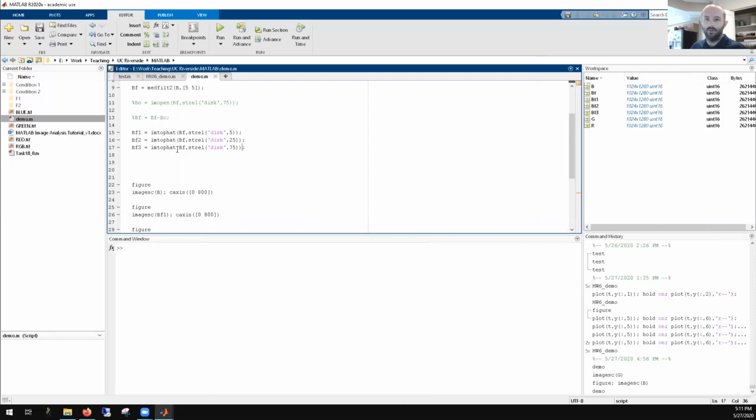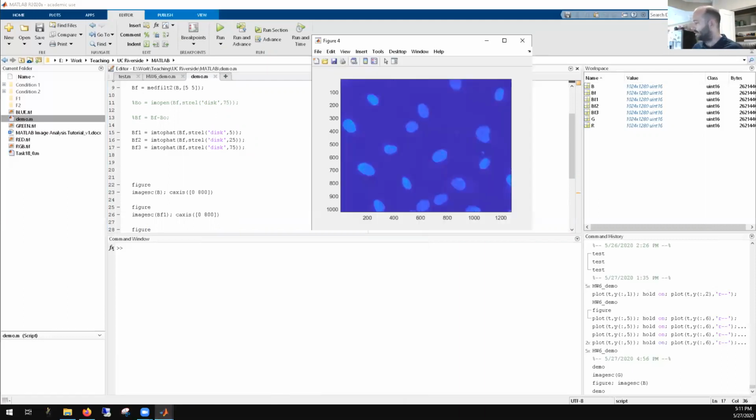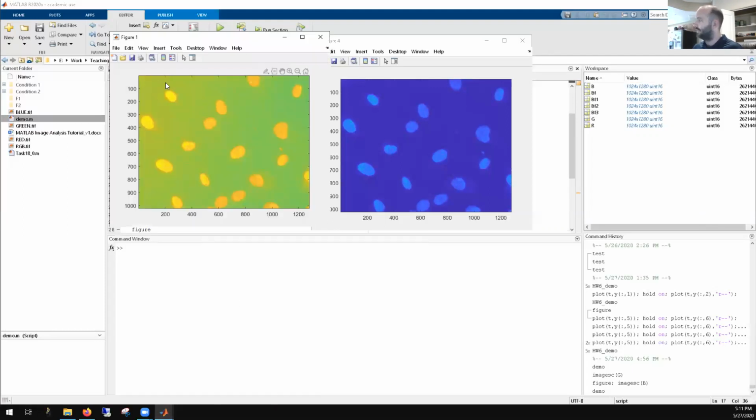If the feature is larger than the ball, then we subtract the feature out, because the ball is just going to follow that feature. So imagine we have this 150 pixel ball. This gentle slope in the background is on the order of hundreds of pixels. So we're going to subtract this large scale feature, this sloping illumination in the background, with our rolling ball filter, but we're not going to roll into these individual nuclei and subtract them out, because 150 pixels is something like this. There's no way that ball is going to fit inside that nucleus.